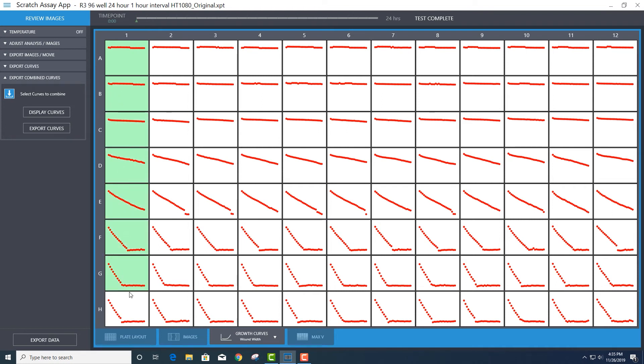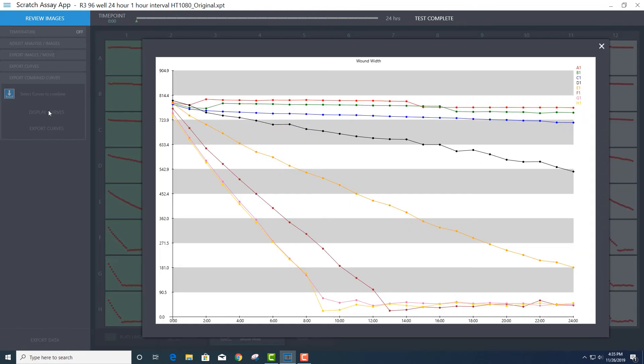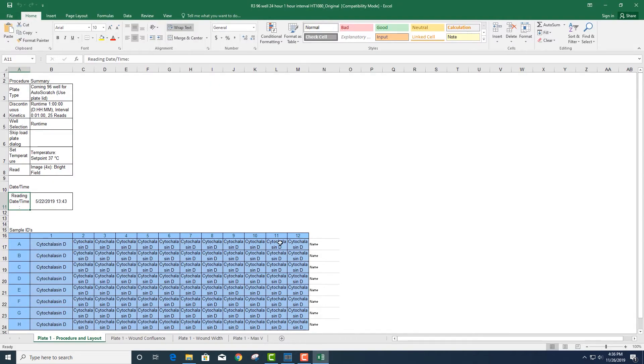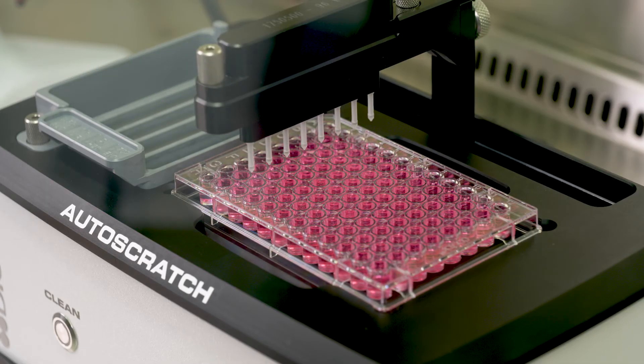Additionally, at the end of the assay, migration rates are calculated and reported for each well. Results, including kinetic profiles and raw data, are easily exported with the click of a button.